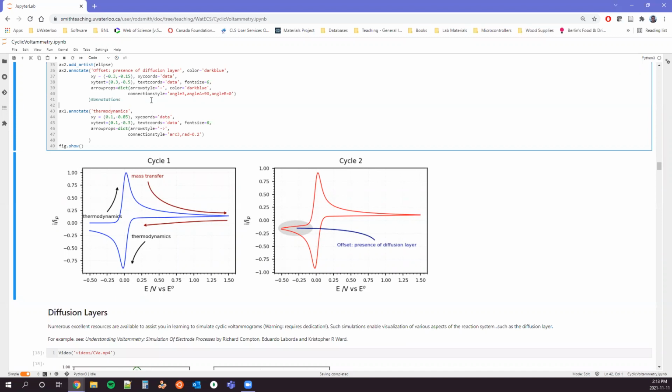Awesome. While we're waiting for any others, I have a couple quick questions. So we talked about mostly 2D electrode surfaces. And I know once you go to, for example, battery electrodes, we talked about how there's solid state diffusion you have to consider. If you have a non-ideal 3D electrode surface, how does that also influence things, or porous electrodes? Does that just make your diffusion much more complicated? It's complicated.